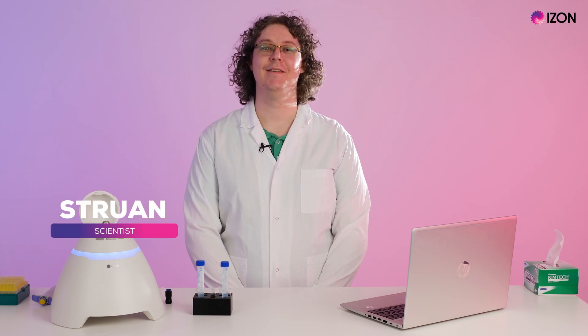Hi, my name is Struan and I'm a scientist at Izon Science. Today I'll be talking to you about performing zeta potential measurements on your Exoid.